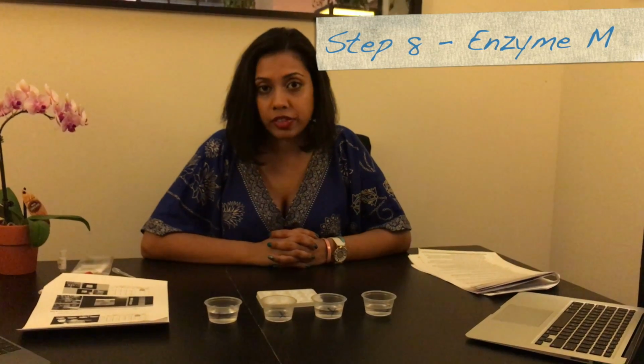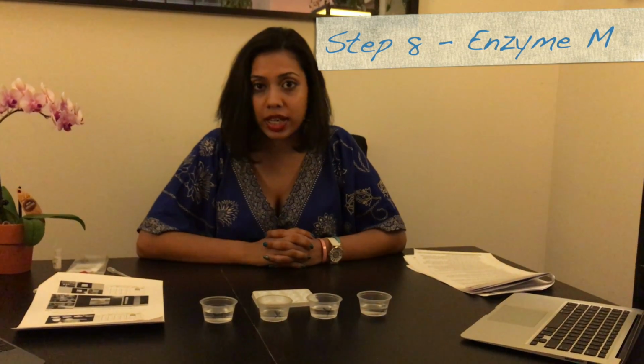After your paper chromatography portion of the lab, you will complete a test for enzyme M. Enzyme M is an enzyme that is present in Botanicurus. And the thought is, if this enzyme is present in Botanicurus and it's present in another plant species, maybe that plant species relates to Botanicurus as they share common enzymes.